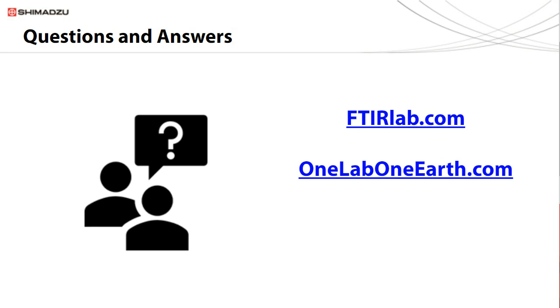Thanks for giving us an overview of different alternatives for analyzing microplastics by infrared. The next question is also for you. We all know microplastics persist in the environment. So the question that came through the chat says, how can we distinguish new particles from others that have been in the water or other environmental samples for a long time?